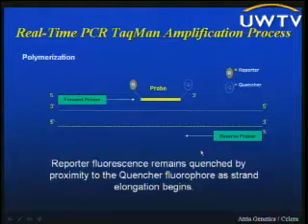So this audience probably is pretty well versed in what the TaqMan assay is, so I'll be very brief here. Essentially what it is a PCR reaction with specifically designed primers that flank a region that interrogates the insertion deletion. And then there's a probe that recognizes the insertion or the deletion, and the probe has conjugated to it a fluorophore, a reporter fluorophore, and then a quencher dye, which, because of its close proximity to the reporter dye on the probe, actually quenches it and does not allow fluorescence to occur.